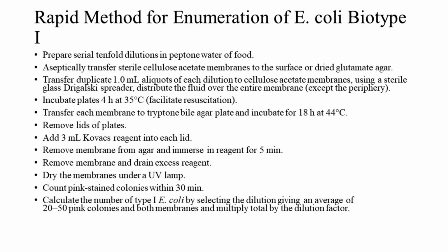Transfer each membrane to a tryptone bile agar plate and incubate for 18 hours at 44 degrees Celsius. Remove lids of plates. Add 3 ml Kovacs reagent into each lid. Remove membrane from agar and immerse in reagent for 5 minutes.